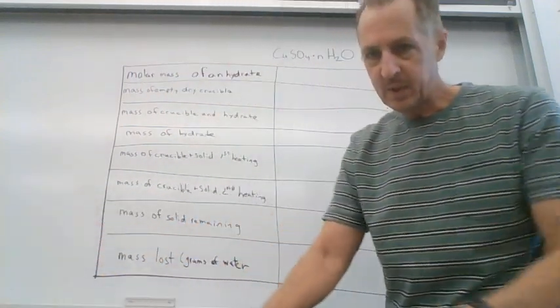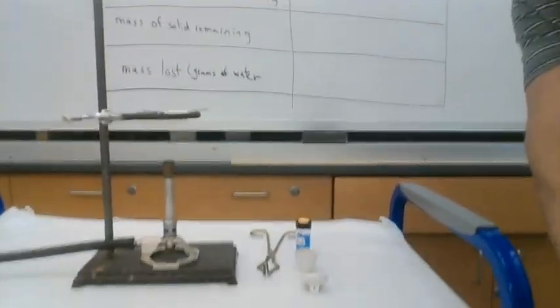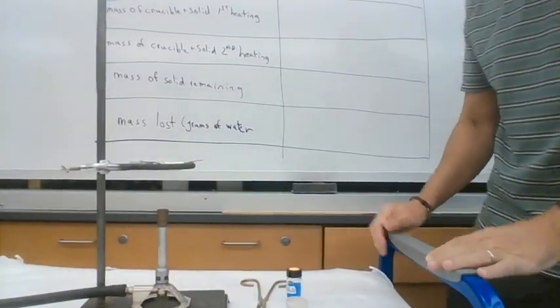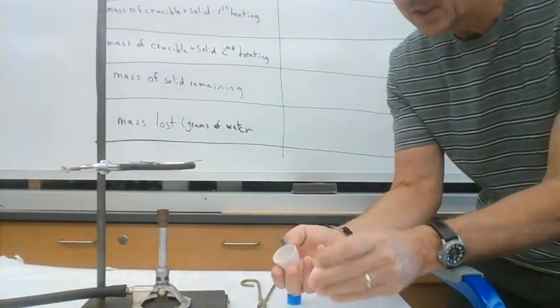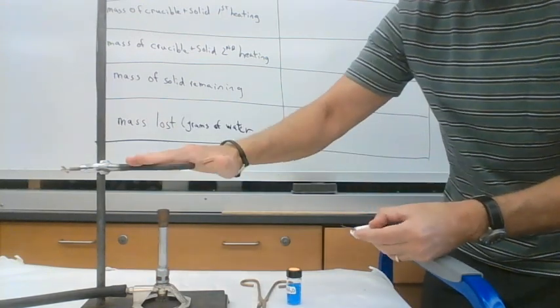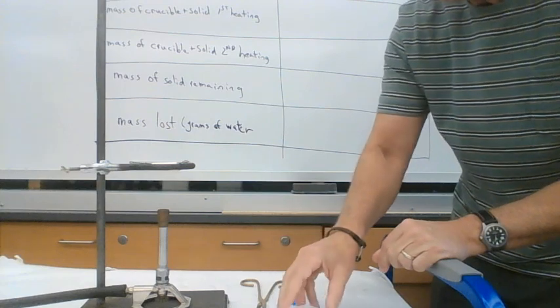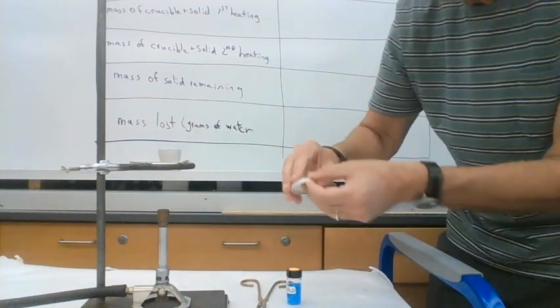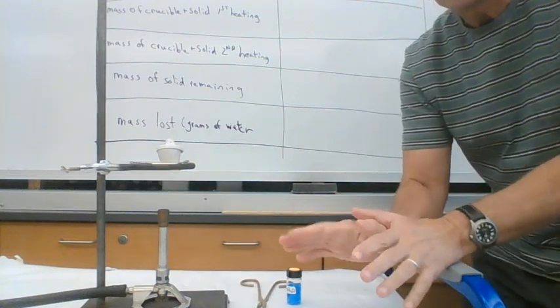So for this experiment, we're going to be using our crucible here, which is, this is our crucible and our crucible cover. It looks like a little acorn. We're going to set up our Bunsen burner with our ring stand. We're going to have a ring, and then we're going to have our clay triangle sitting here. And the first thing we're going to do is put our crucible on the ring stand, and we're going to heat that crucible for 10 minutes.